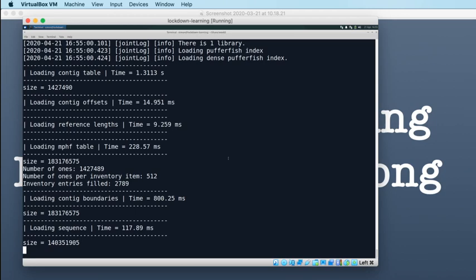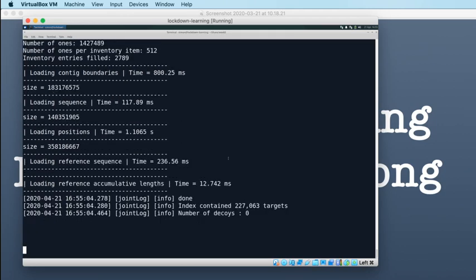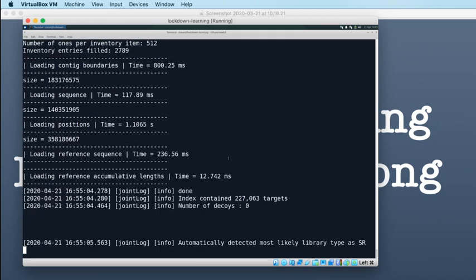Okay, so it hasn't immediately failed. That's the first thing: if it wasn't going to work, I would expect it to immediately not work, to do something that told me that it's not going to work. Since it's not done that, since it actually seems to be doing something, I think, fingers crossed, that this is actually working.